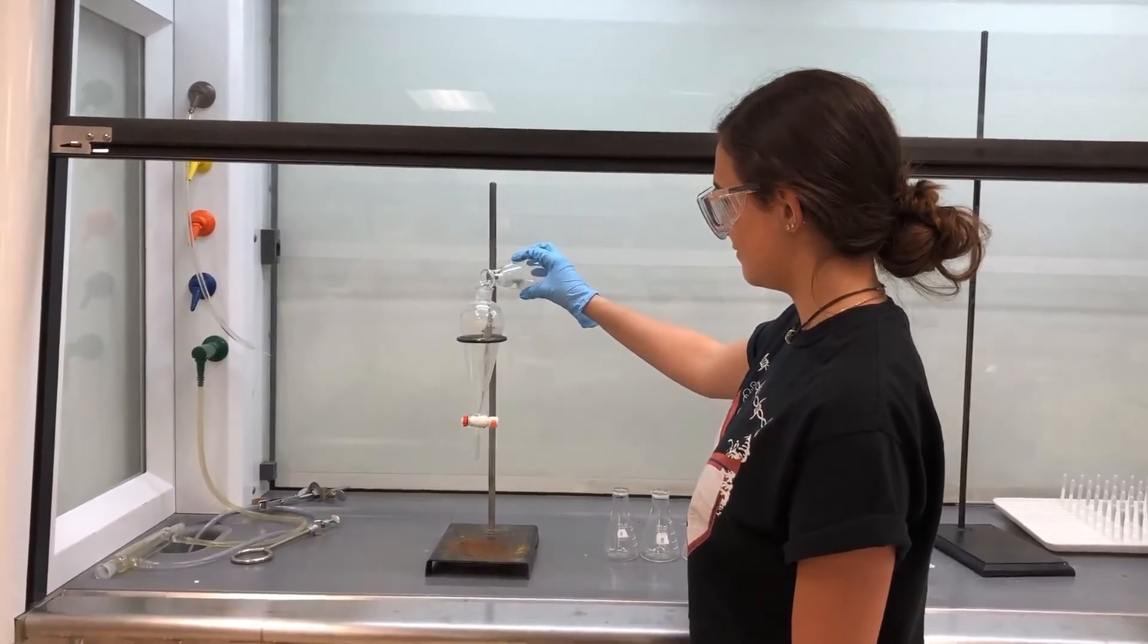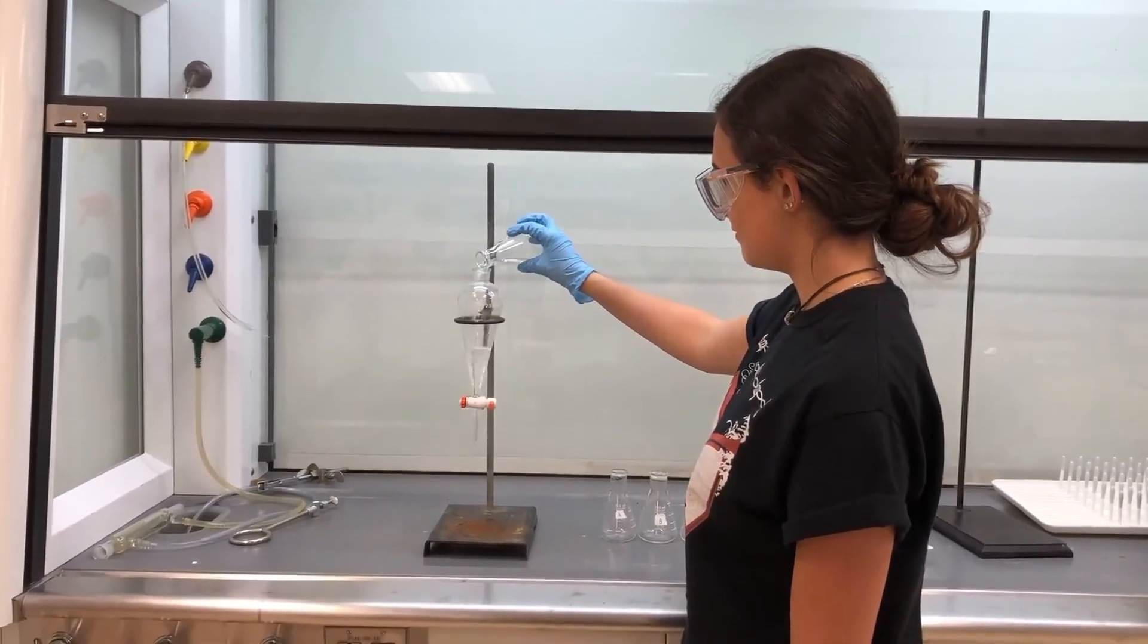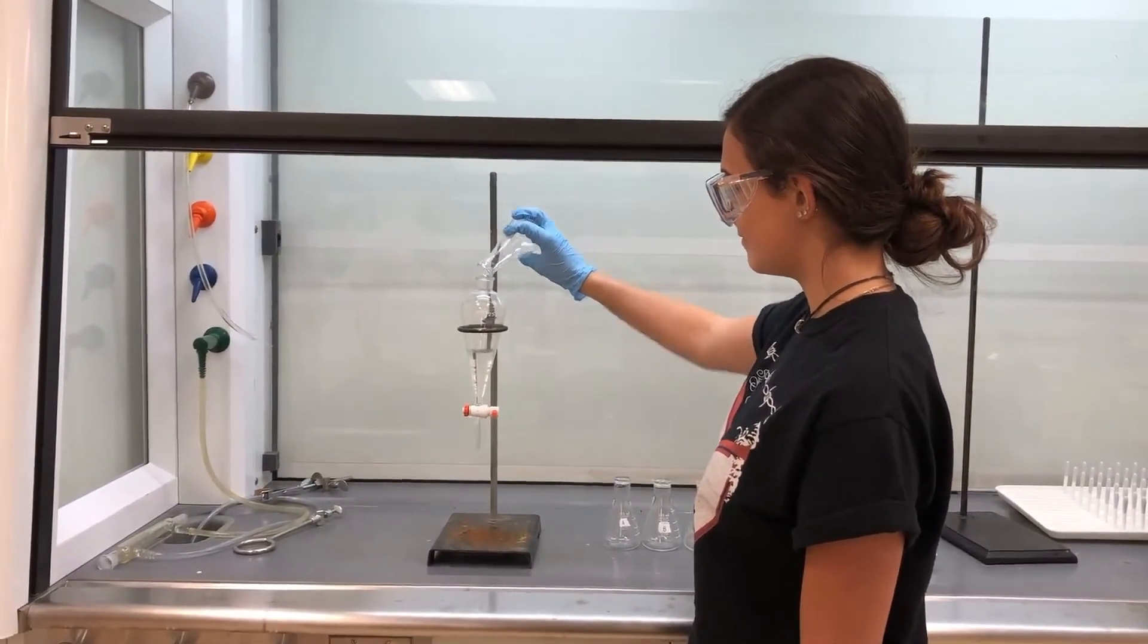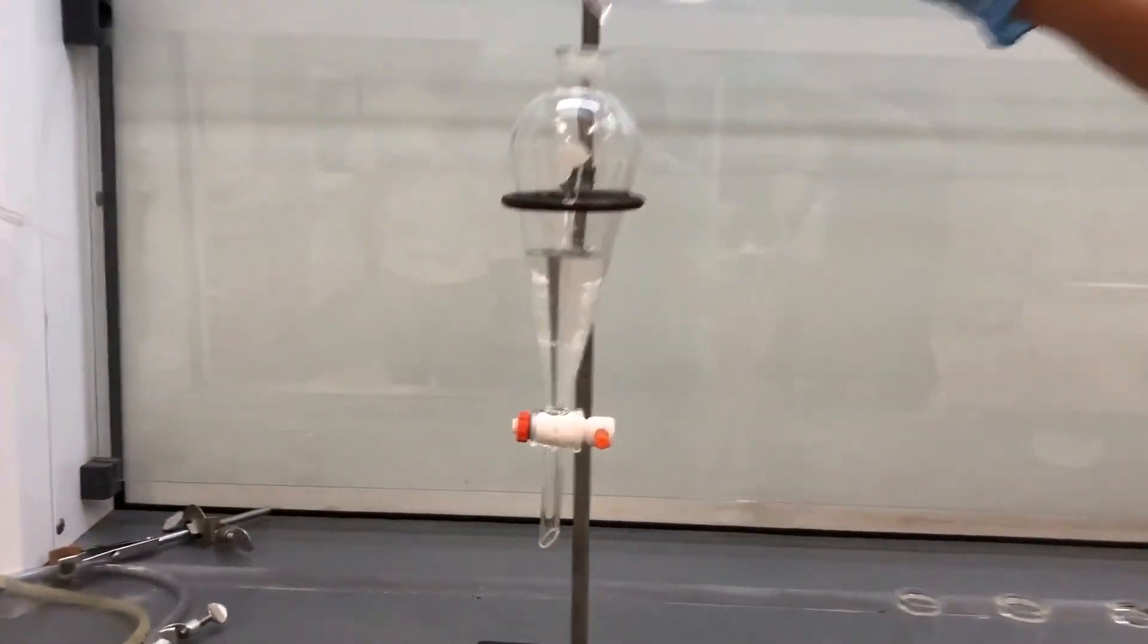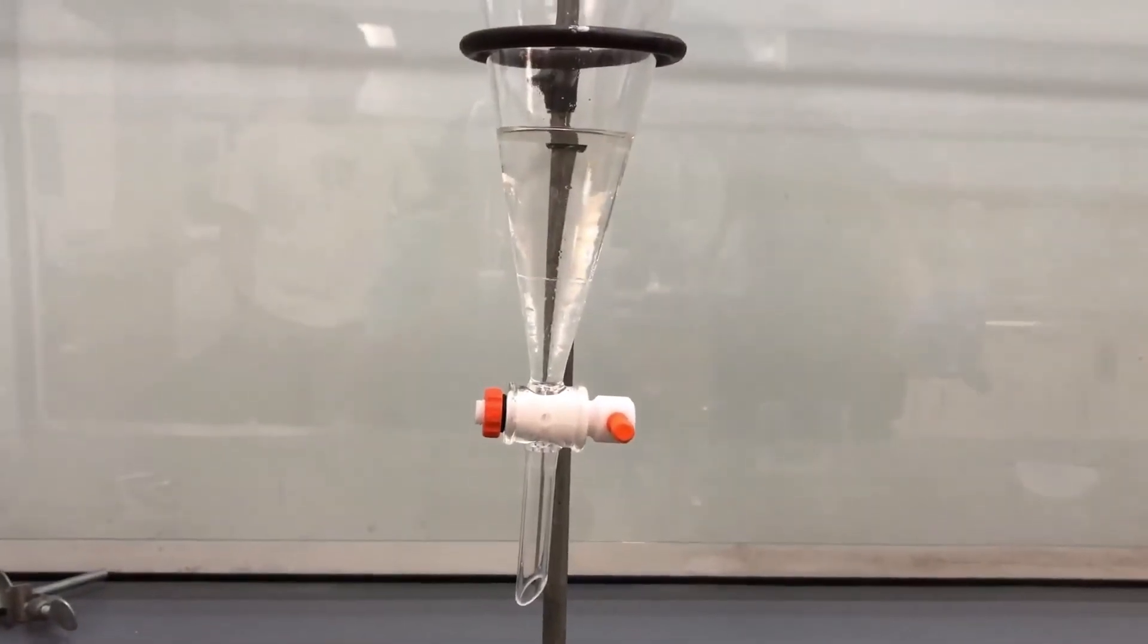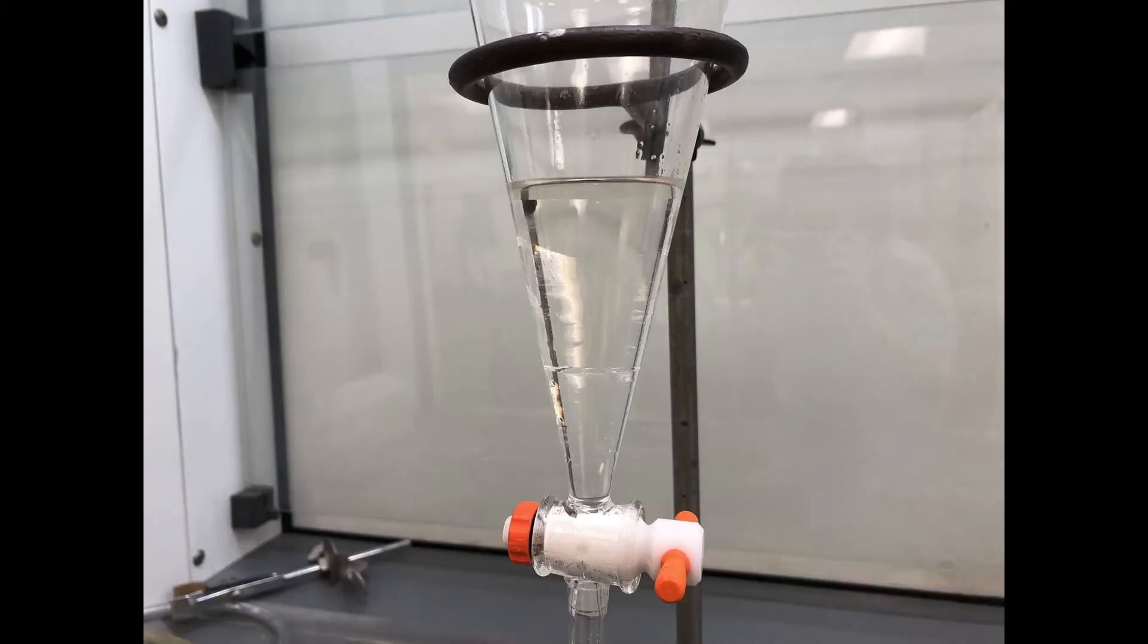You are going to stir diethyl ether and your solid mixture until everything is completely dissolved and then pour that mixture into the sep funnel. Water will then be added. When this happens, you will see two distinct layers form.